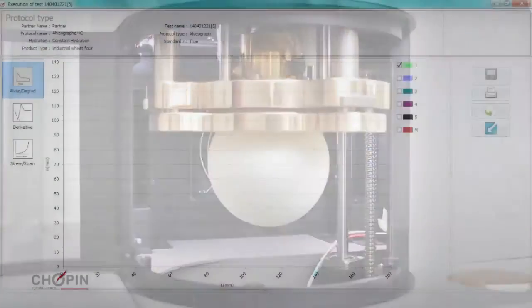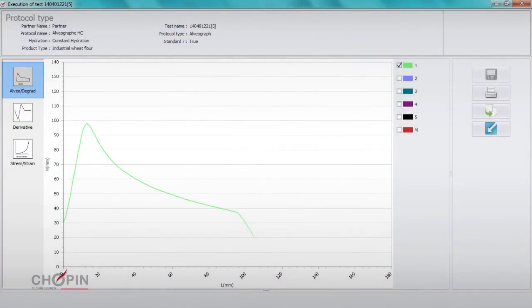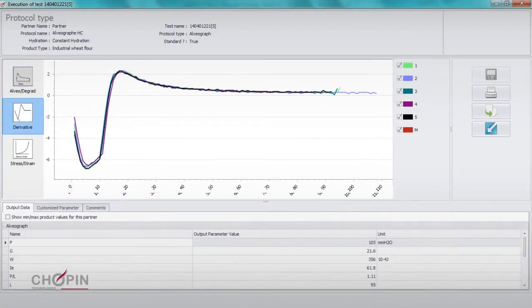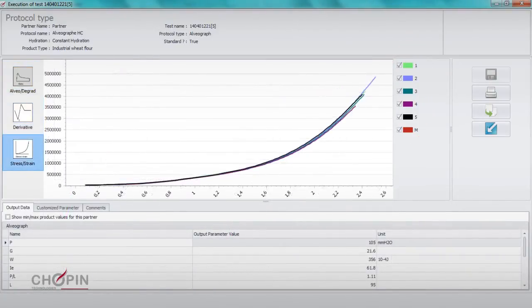The dedicated control software also represents a significant innovation. Straightforward, comprehensive, and intuitive, it permits test results to be more comprehensively analyzed. Additional parameters such as first derivative, stress strain parameters, and mixing consistency are now available.